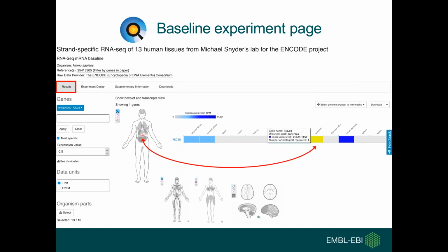Looking at the heat map now in more detail, you can hover over points in the heat map to investigate further. For example, hovering over the point for Reg1b expression in the pancreas displays a mouse over with gene name, organism part, expression level, and number of biological replicates for that sample. Hovering over the data point in the heat map also highlights the position of the respective organism part in the anatomogram to the side of the page. Just to quickly note that there are a number of thumbnails by the anatomogram, and clicking on these changes the anatomogram to reflect specific genders or highlight particular tissues.